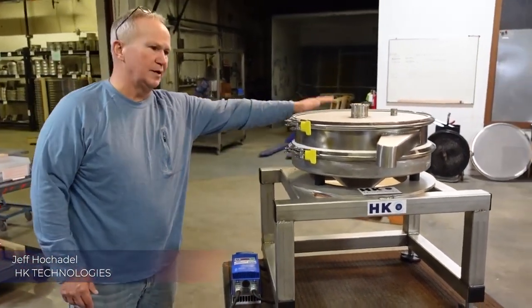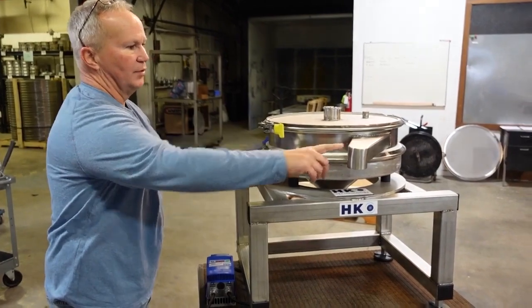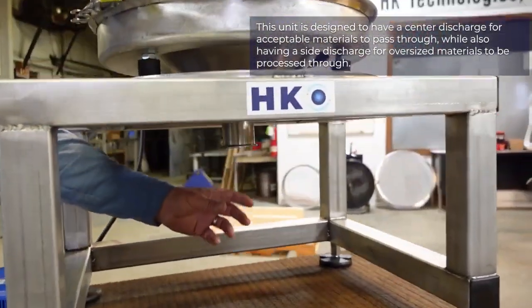It consists of one single vibratory motor mounted on three isolation mounts. This particular unit has an oversize outlet for the plus material. There's a screen on the lower section, and your fines are discharged underneath the machine.